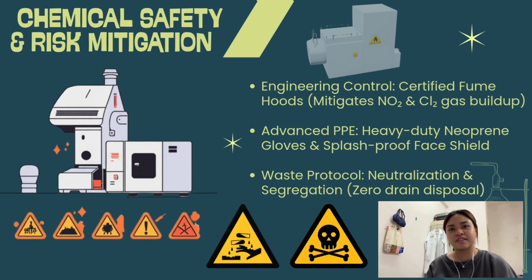Secondly, standard laboratory PPE is completely insufficient here. Thin nitrile gloves offer zero breakthrough time protection against aggressive acids or strong base baths. Analysts must step up their safety literacy by consulting safety datasheets, which dictate the mandatory use of thick, chemical-resistant neoprene or butyl rubber gloves, a full-coverage splash face shield, and a heavy-duty chemical apron over standard lab coats.